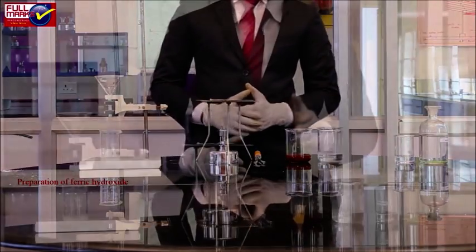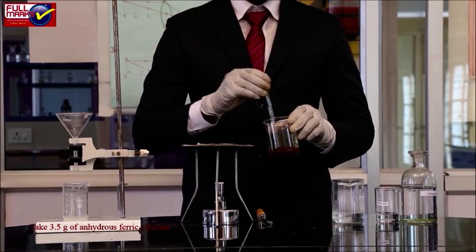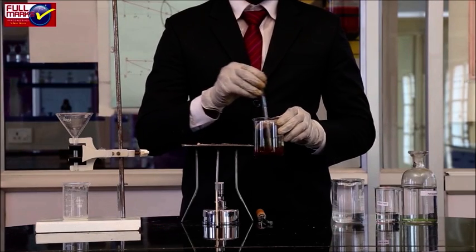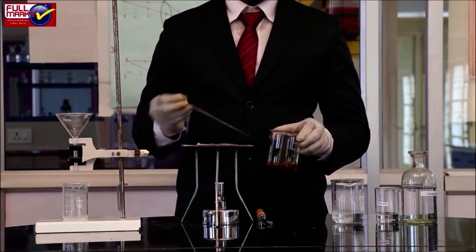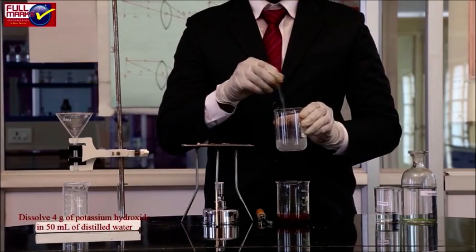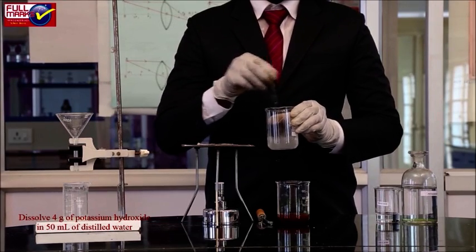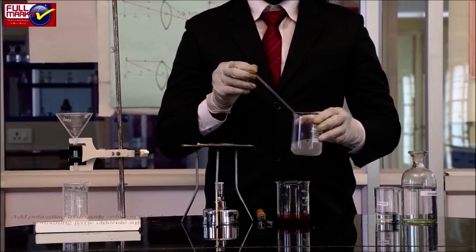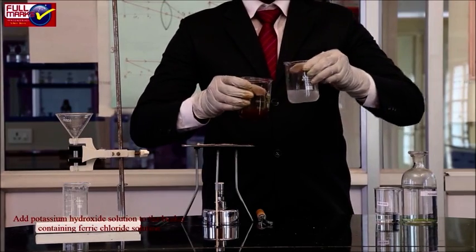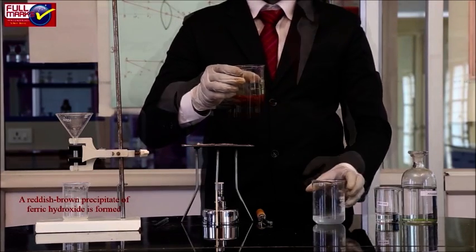Preparation of ferric hydroxide: Take 3.5 grams of anhydrous ferric chloride in a 250 ml beaker. Dissolve it in 50 ml of distilled water using a glass rod. In another clean beaker, dissolve 4 grams of potassium hydroxide in 50 ml of distilled water. Add the potassium hydroxide solution to the beaker containing ferric chloride solution in small portions with constant stirring. A reddish-brown precipitate of ferric hydroxide is formed.